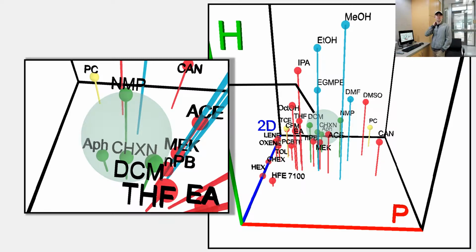When cleaning the Sharpie off, it was pretty clear that the bad solvents would basically not touch it. And all the good solvents that I have here would clean it perfectly. So if it's in this diagram as a clean solvent, it's going to clean it down to the glass and get it off.